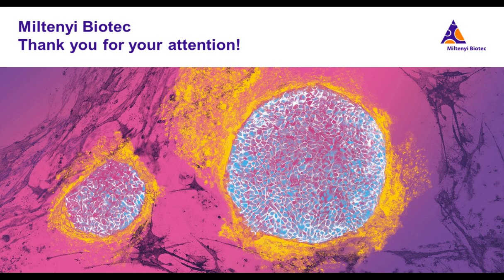The size of the region of interest is important, but the shortest cycle will be roughly 30 minutes, maybe some minutes more, and this can go up to several hours if you are, for example, analyzing a whole mouse brain. So this is the range you can expect.